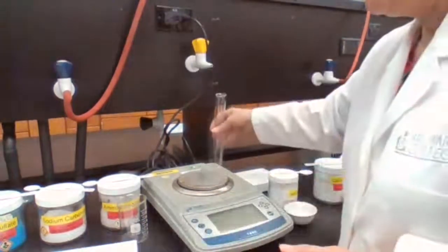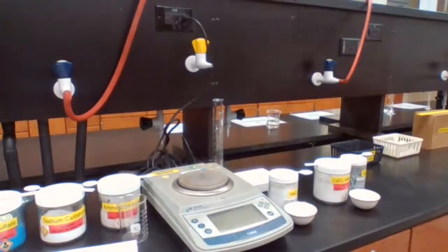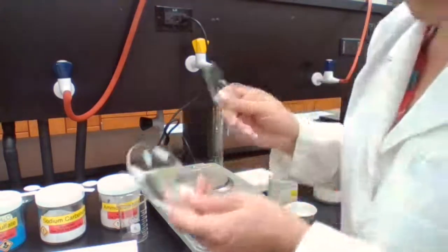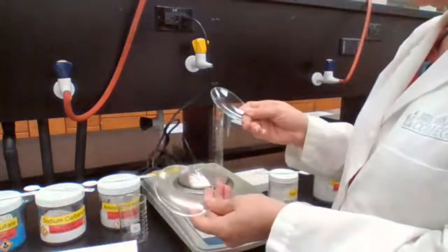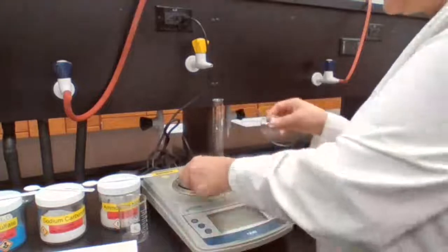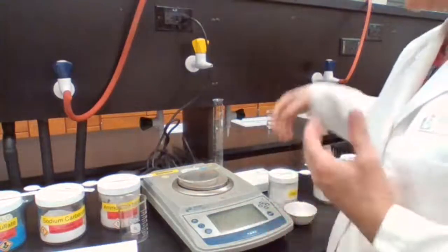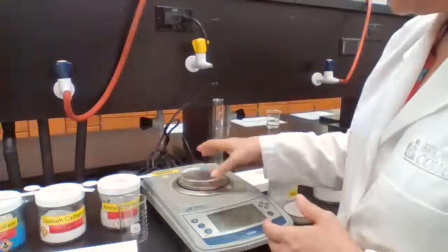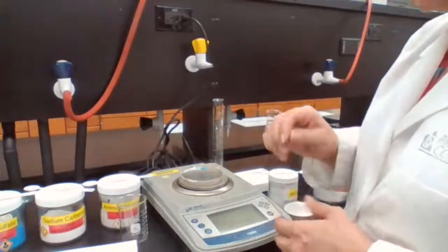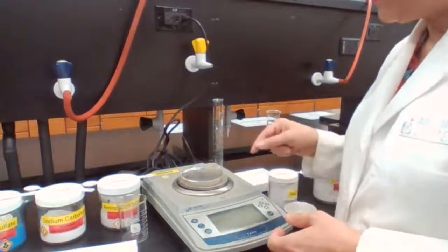The next item to be measured is the mass of a watch glass. Different watch glasses weigh differently. Like this one is about 30, and the other one is about 48. The point of this practice is not to measure the mass and record it for calculation. The point is to practice enough using the balance.